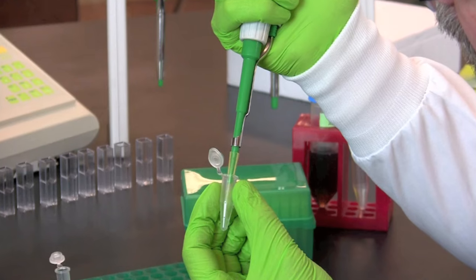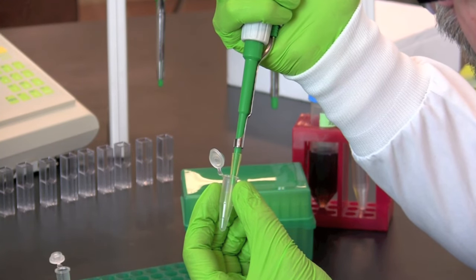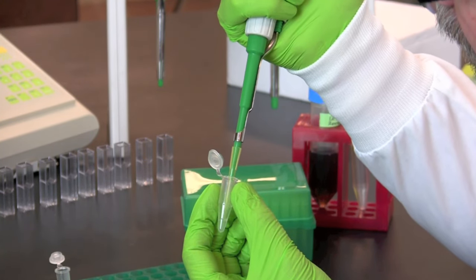Mix the milk sample and PBS by either pipetting or vortexing. This mixture has diluted the milk to 1 part in 50.